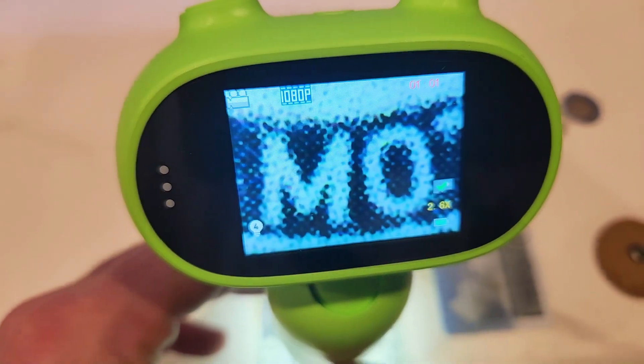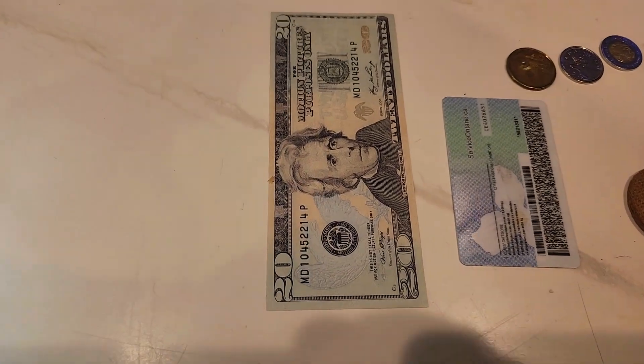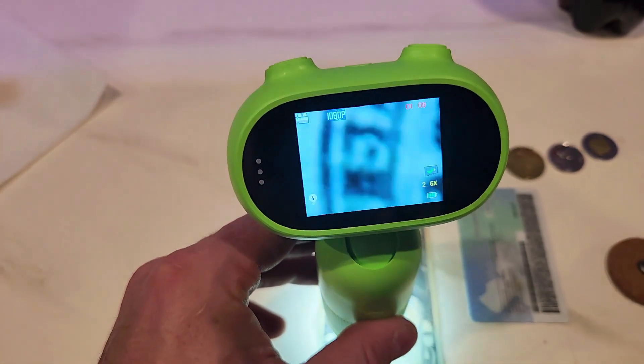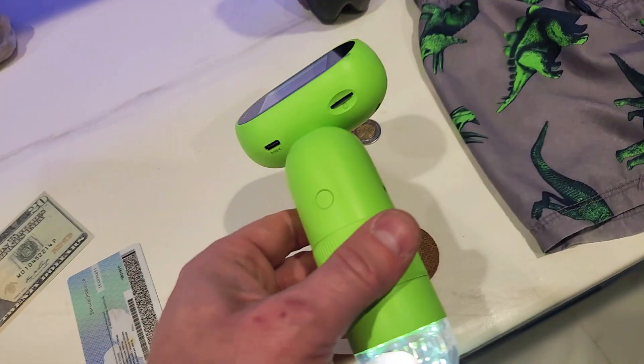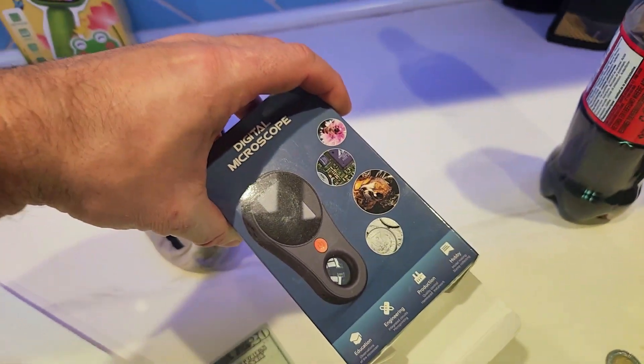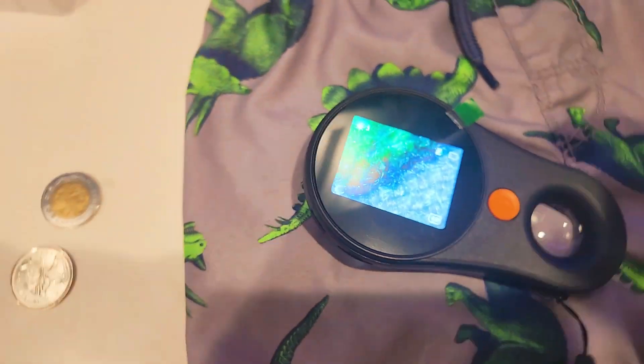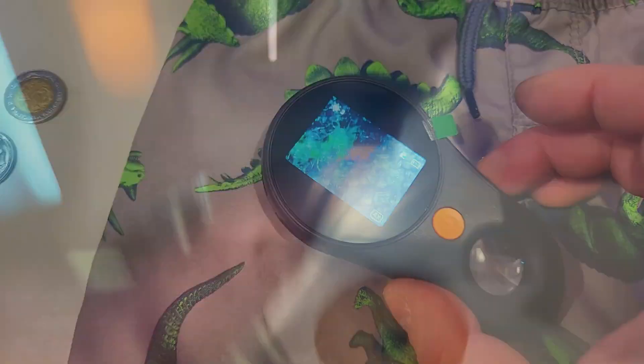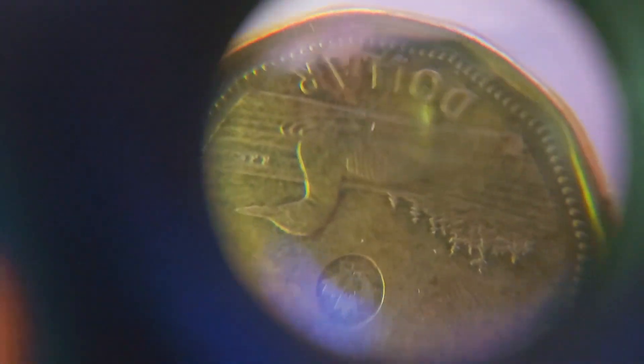Let's take a look at this dollar bill. Just so you can get an idea of how close the zoom is — this is 1000x, that's the maximum on this unit. Now this little one goes all the way to 500x. As you can see, it clearly shows the fabric of a t-shirt very close. It also has autofocus, but it doesn't have the ability to record video — though you can still take images to the SD card. It also comes with an extra magnifier glass you can use when the battery runs out or if you don't want to use the screen, but it doesn't magnify all the way to 500x — maybe about 20-30x.